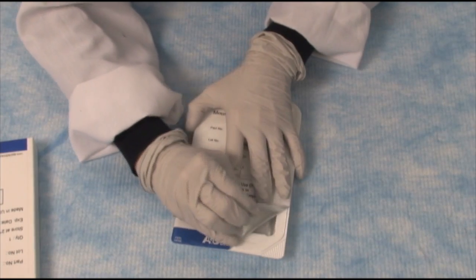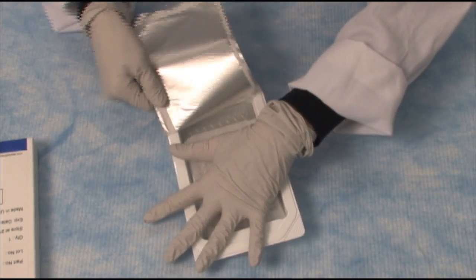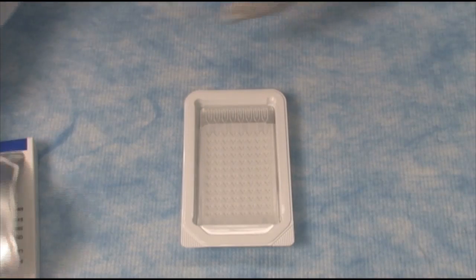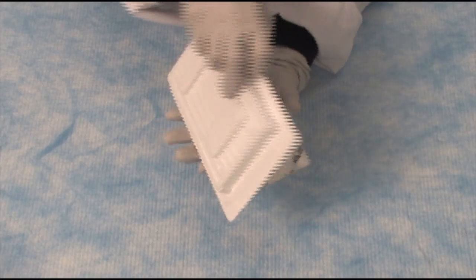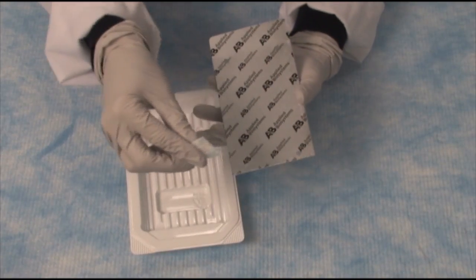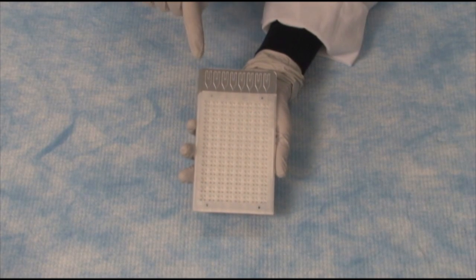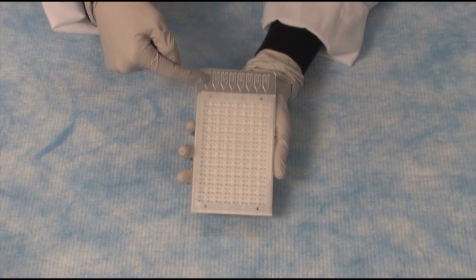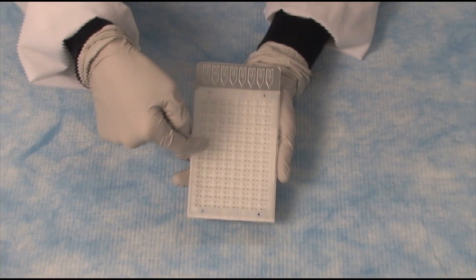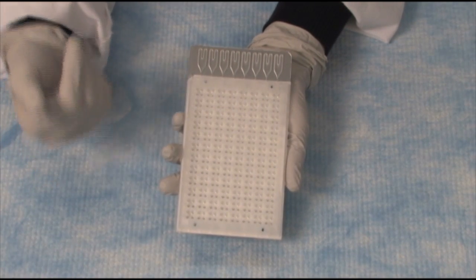I will now open up the card. Here is the card — I'll pop it out. It comes with a little desiccator. This is what the TaqMan Array card looks like. We have up here eight different ports, and each of these ports corresponds to 48 different wells. In each of these different wells is a dried-down TaqMan assay.